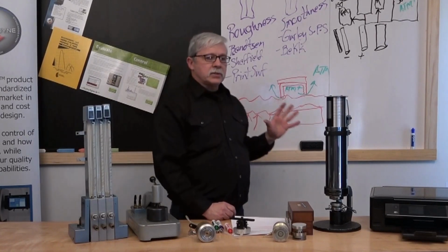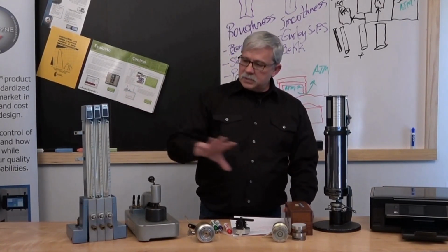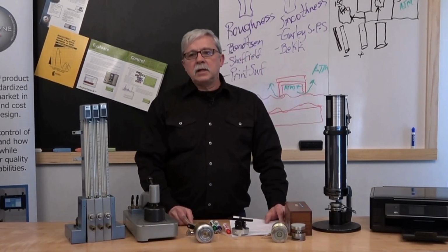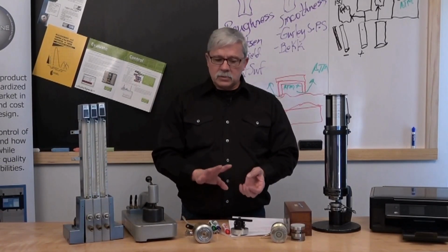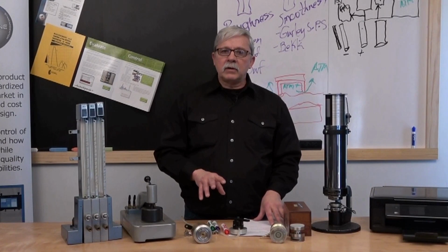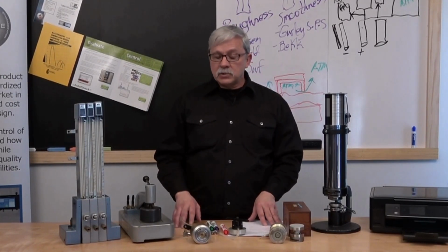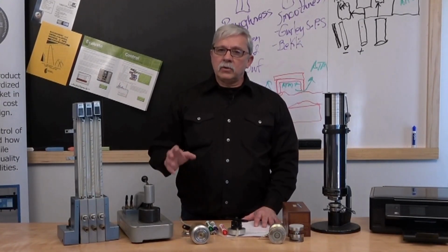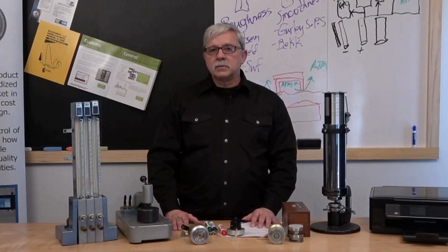What I want to do now is touch a little bit on the history of this particular test. I mentioned early on that these pieces I've got out here on the tabletop represent just about everything you might come across in a typical lab assessing the roughness or smoothness of a product, whether in Europe, the States, South America, or anywhere internationally. Somebody selling to the print industry or to people who utilize a printer or xerographic machine is going to have specifications. They know what works for their converting process, and they can provide us that information so that we can assess with these tools how our production is working.